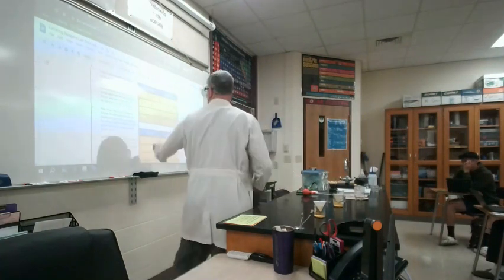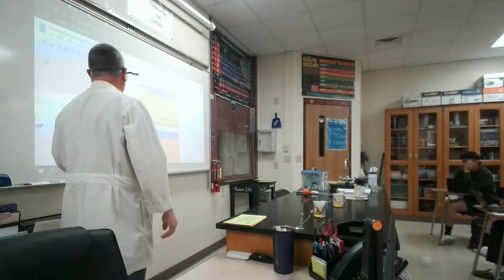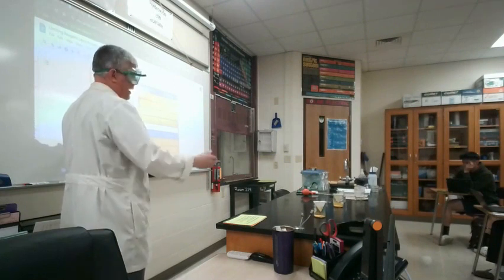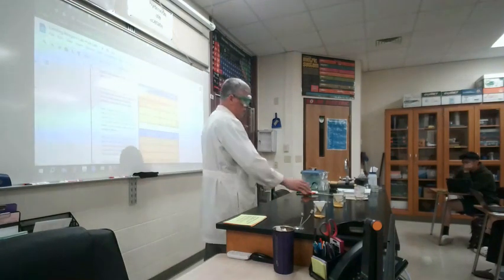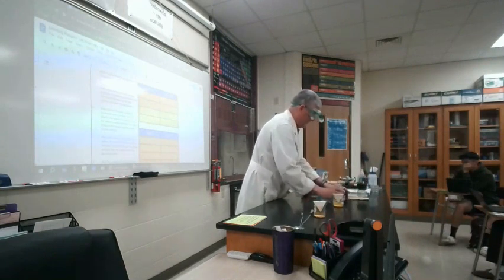Okay? That's what they're telling you to do here. Now measure out your assigned volume of sodium iodide with the pipette and bulb to be used only for the sodium iodide. That is the red one. And add it slowly to the beaker with the lead nitrate solution. So you're done with this, you put it back. You now take this one, ladies and gentlemen.